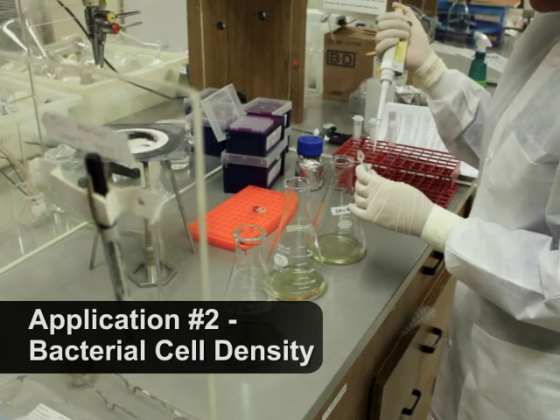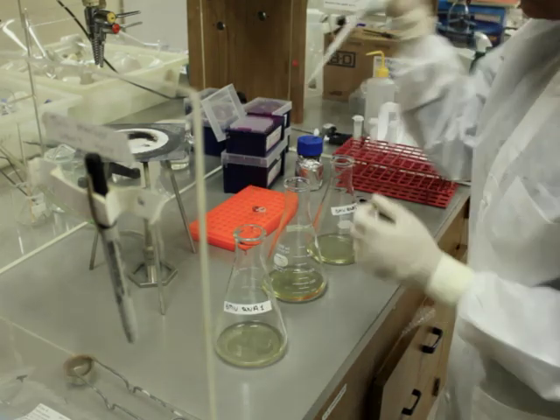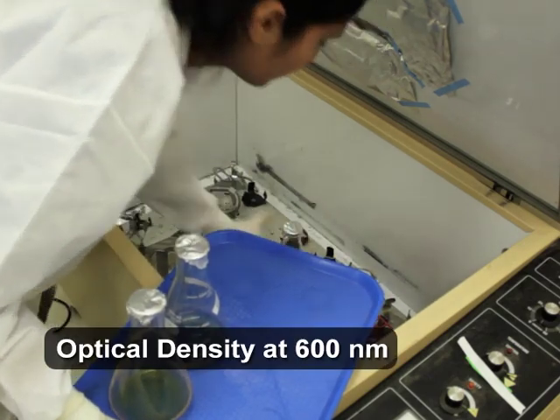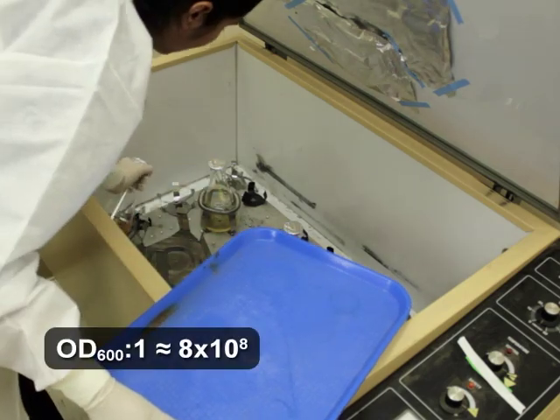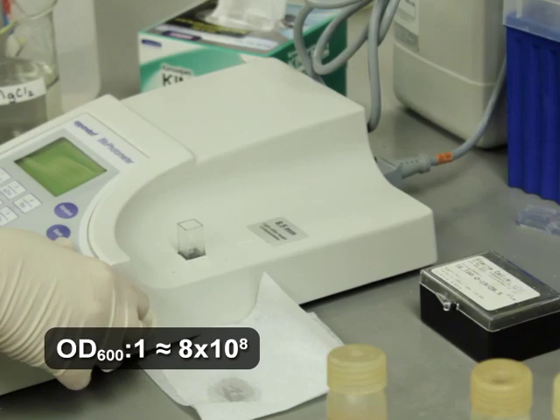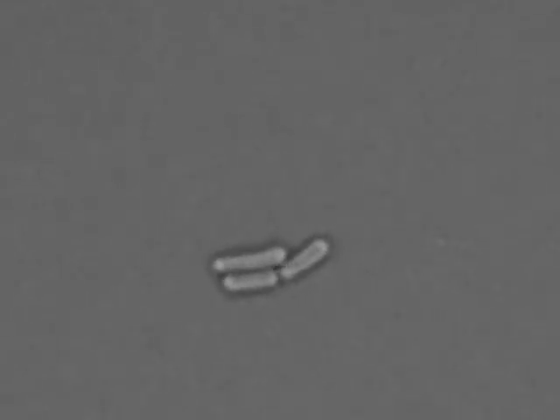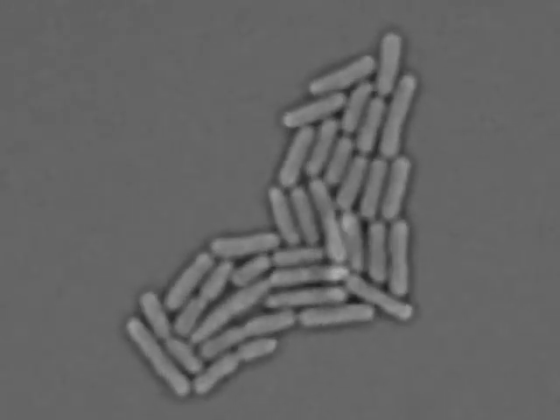UV-Vis spectroscopy is also used to quantify the amount of bacterial cells in a cell culture. For this measurement, the absorbance, or optical density, is measured at 600 nanometers. Typically, an OD 600 measurement of 1 indicates the presence of 8 times 10 to the 8th bacterial cells per milliliter. Measuring the cell density throughout culture growth enables the determination of the bacterial growth curve, and can help to identify when a culture is in its exponential growth phase.